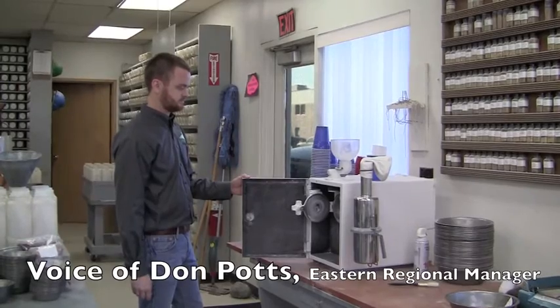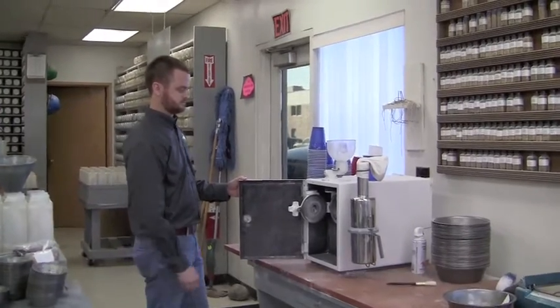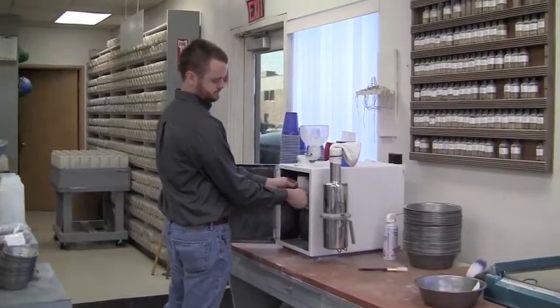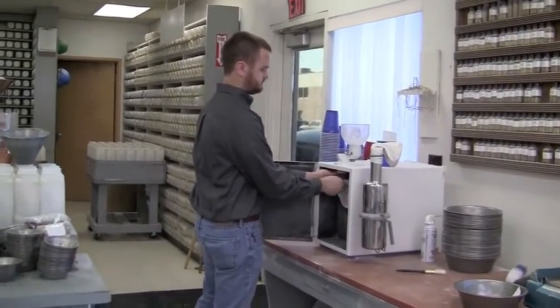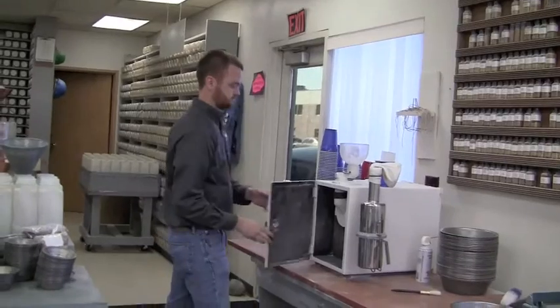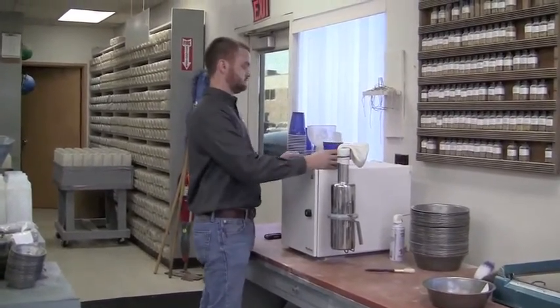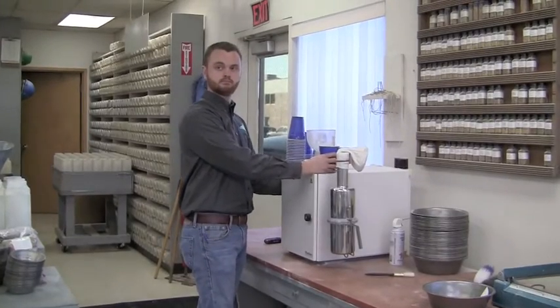This is the Laboratory Mill 3100, the approved grinder for the falling number machine. Scott showed you the inside and now he's going to put in 250 grams of clean wheat from the representative sample. Go ahead, Scott.